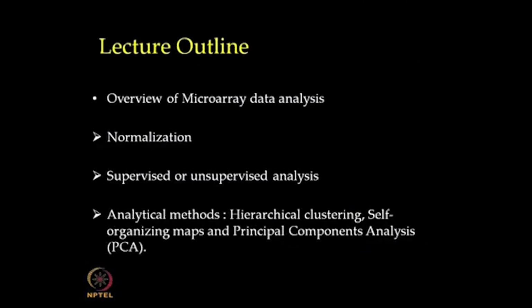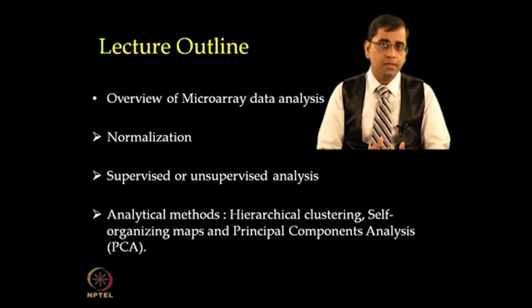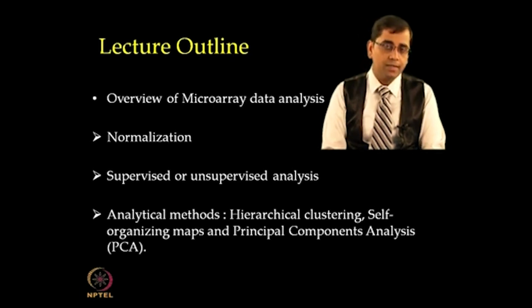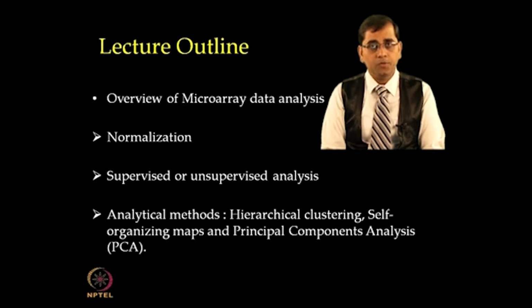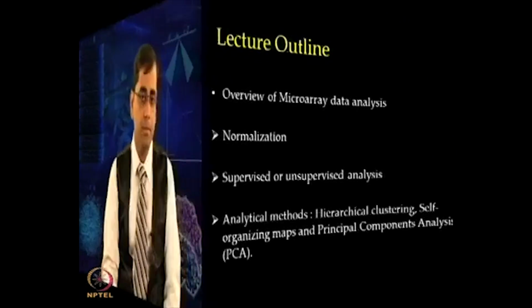In today's lecture, we will talk about microarray data analysis to cover various types of concepts such as normalization, supervised or unsupervised analysis, different types of analytical methods such as hierarchical clustering, self-organizing maps and principal component analysis. But before we move on to very advanced modules, let us discuss some basic concepts involved in the data analysis.